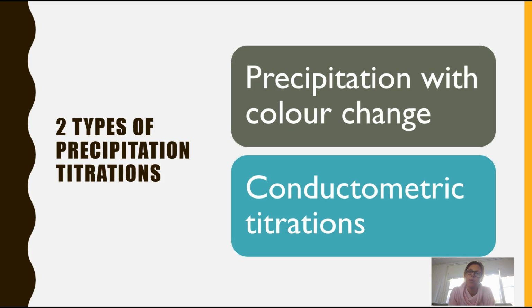So you'll remember when we've looked at conductivity graphs before, when we were doing acid-bases, we saw that V-shaped graph where as we were adding more of our acid or our base, the conductivity decreased and increased again, and at that point that center of the V was where our endpoint was. Similar determinations can be made with the conductivity with our precipitation reactions.